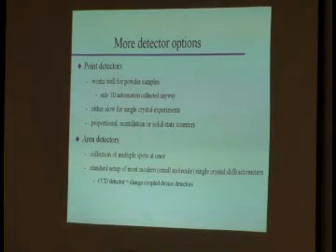Most modern single crystal diffractometers will no longer use point detectors. They will use what is called an area detector. What that allows you to do is collect a portion of reciprocal space at once, okay? That's obviously a big advantage when you deal with a single crystal, where most of reciprocal space has no reflections, okay?